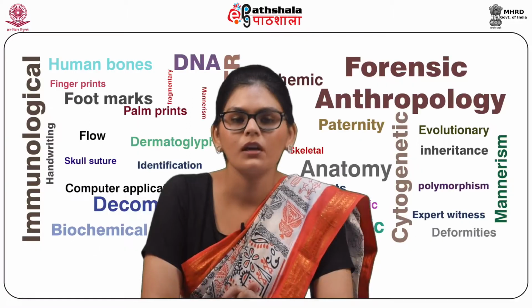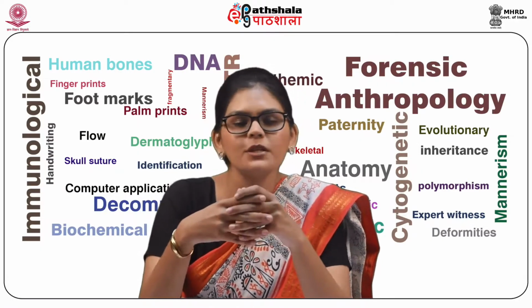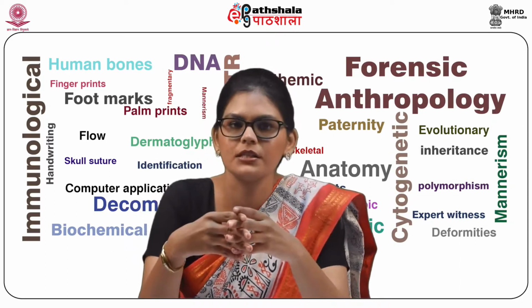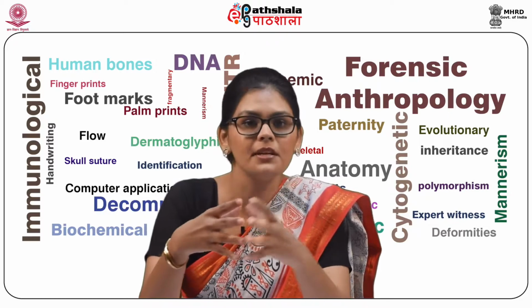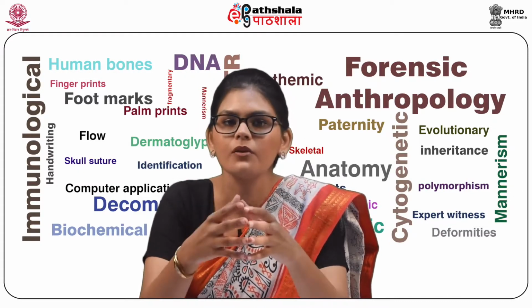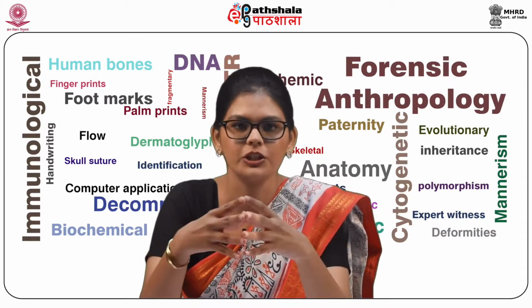So students, let us see what we have learned from this module. Hairs are biological specimens and are subject to variation. During the analysis of hair, the examiner must establish the range of variation in the sample and then determine whether the questioned hair fits in that range.